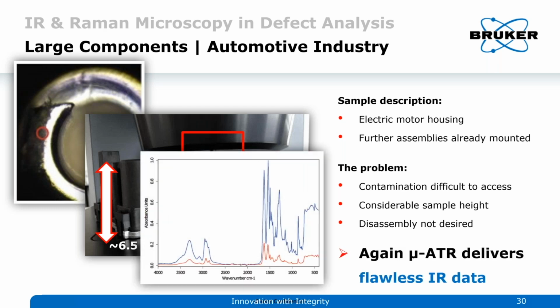And there's the spectrum. Again, the micro ATR works. The crystal face is so small that your analysis area is such that you can just get into tight areas. You get a beautiful result in a single scan that shows the polyamide result.